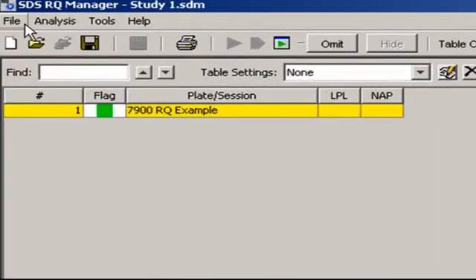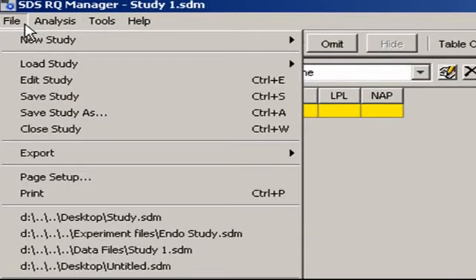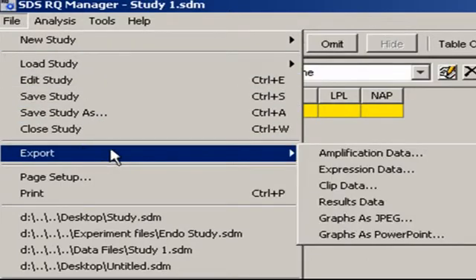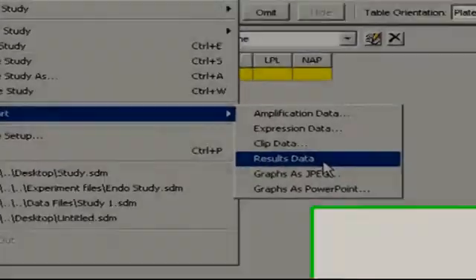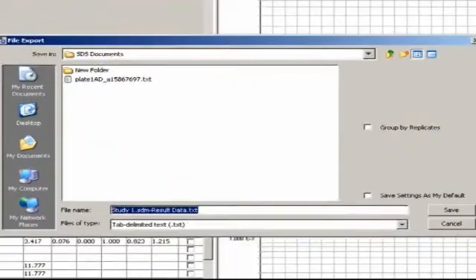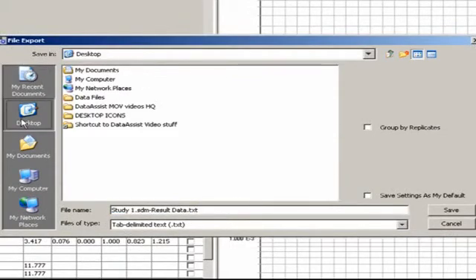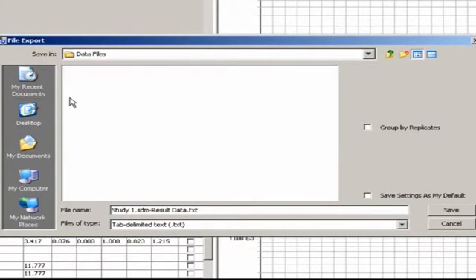Do that by going to File, Export, Results Data. Navigate to the location where you want the file saved, and Save.